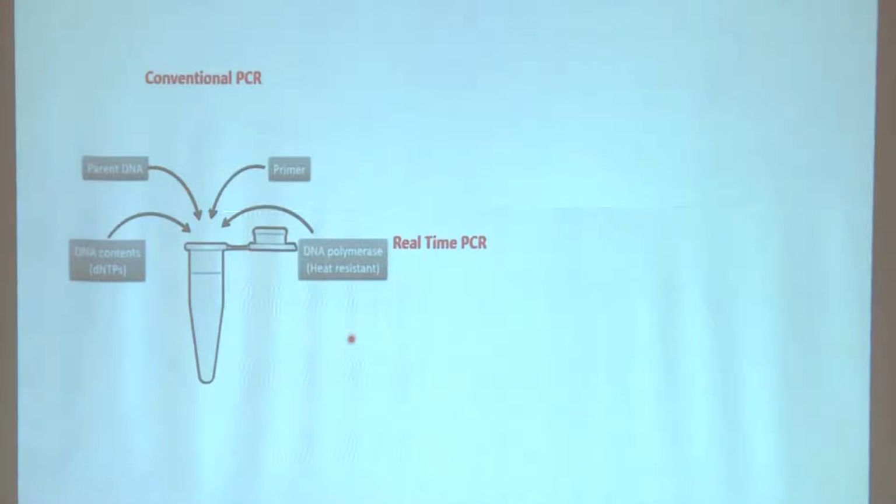This is a typical conventional PCR. You have already done it, right? You have a primer, you have template DNA, and you have dNTPs and other additives, and of course, you have the most important enzyme, that is DNA polymerase.